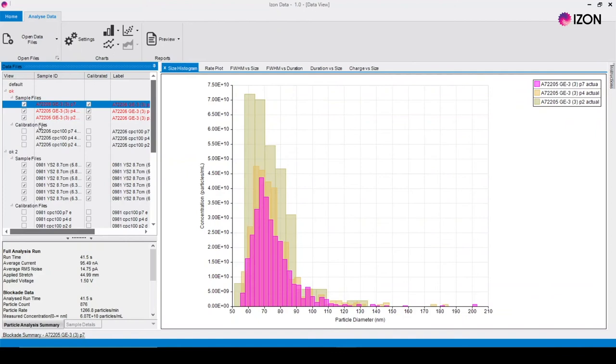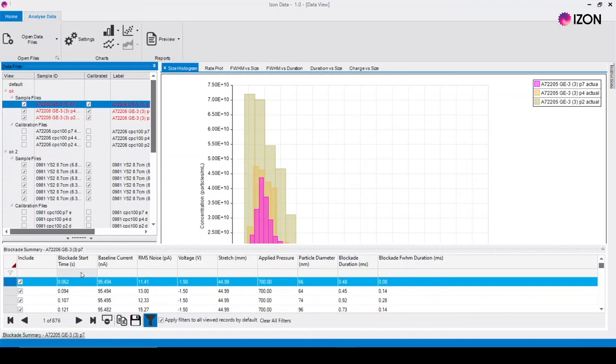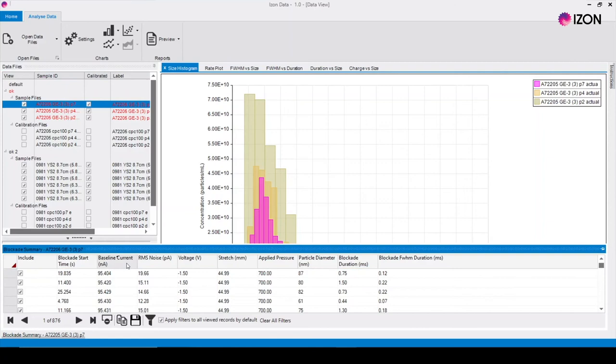To filter your data hover over the grey bar at the bottom left of the screen. This displays all data points in the data set in list form. The data can be sorted by each metric and individual data points can be excluded or included by clicking their checkbox.